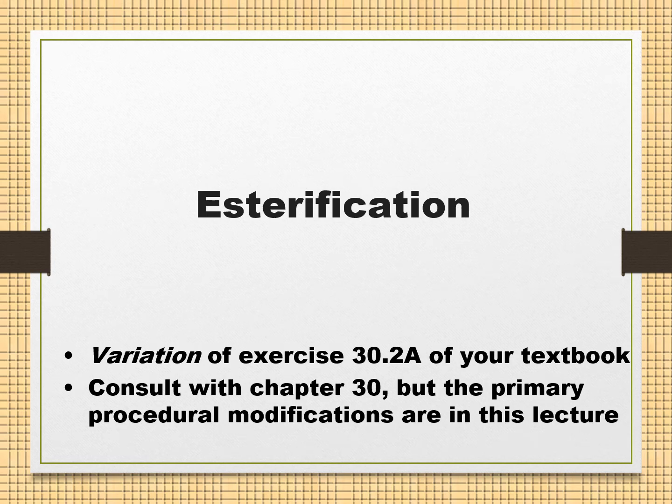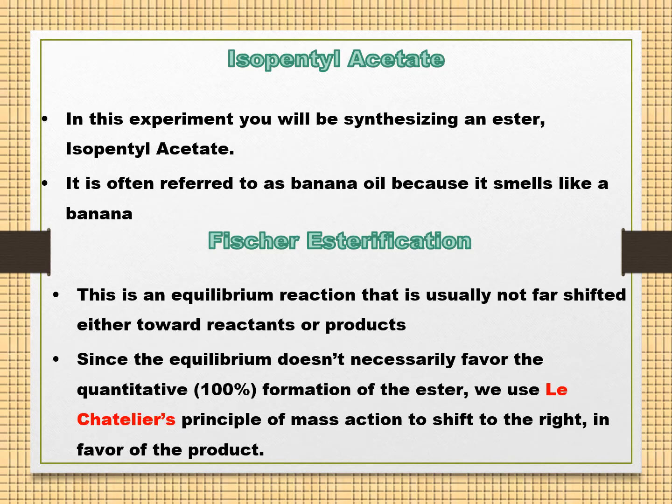Esterification reaction. If you remember from your high school chemistry classes or previous chemistry classes, an esterification reaction is a reaction where an organic acid reacts with an organic alcohol to form an ester. In this experiment, we'll be synthesizing isopentyl acetate from isoamyl alcohol and acetic acid. This ester is known for its unique smell, that it smells like a banana, and for that it's called banana oil.